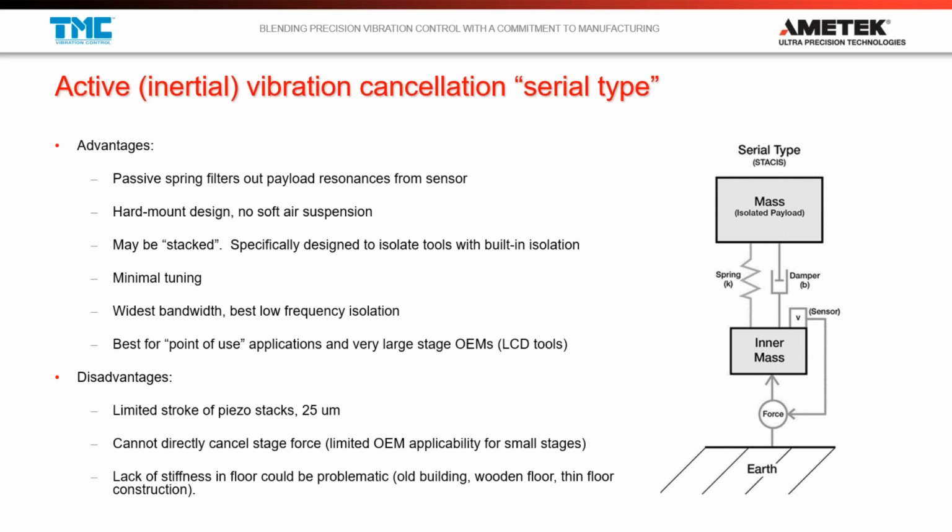These two have some of their own disadvantages. It's a piezo-based system, which means we're going to have a very limited stroke. So if we start to get into a floor where you can feel the floor vibration physically, you probably don't have enough stroke in a piezo, because we're talking about micron displacements here that we're able to provide. But even at microns, as you guys saw before, these types of displacements can cause problems at the nano and micro level. Another thing they can't do is cancel motion on the payload. But again, if you really want to cancel payload motion, there's systems for that. What we're trying to focus on here is floor vibration cancellation.